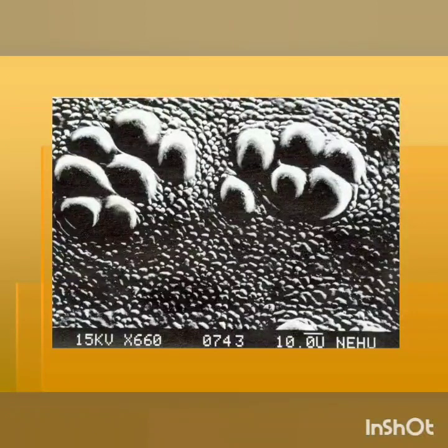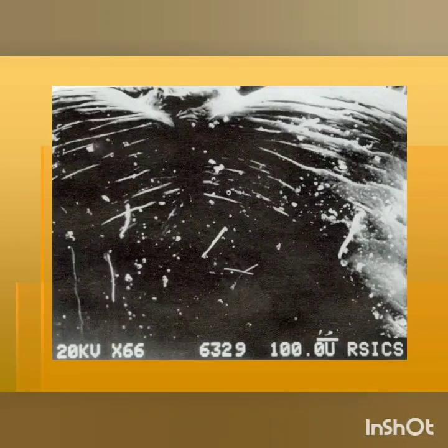This is the enlarged view of the dome-shaped gravity receptors, or dorsal campaniform sensilla. When we compared with some silk moth larvae which do not feed in vertical position but can feed only in horizontal position, we found that there is no such dorsal campaniform sensilla or gravity receptors.